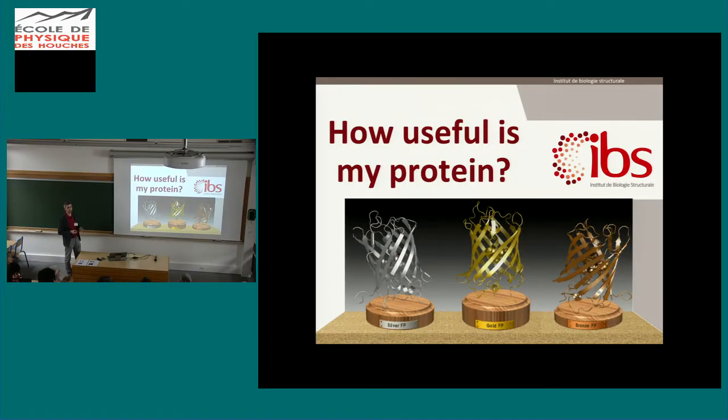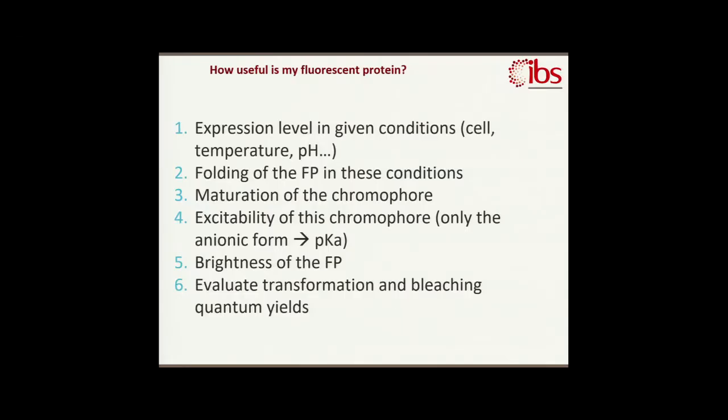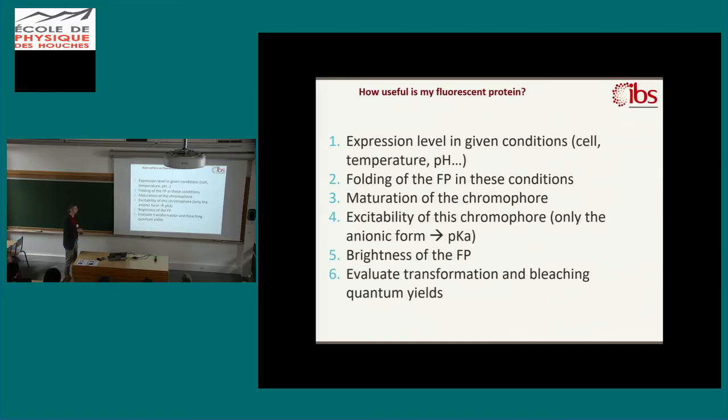So how useful is my protein? Once you've made this first quality check, you have to go further and make all the battery tests if you really want to know whether you have a better protein, a better mutant. So that's all the different steps I'm going through each cycle of engineering: the expression, the folding, the maturation, the excitability, the brightness, and the phototransformation quantum yields. That's for one cycle. If you want to make a directed evolution, you'll have to engineer and come back to maybe the structure, see what changed, and come back for yet another cycle, and so on.